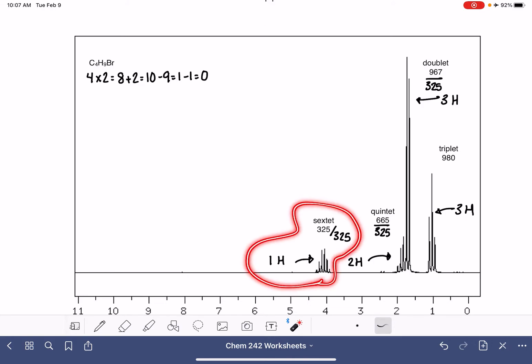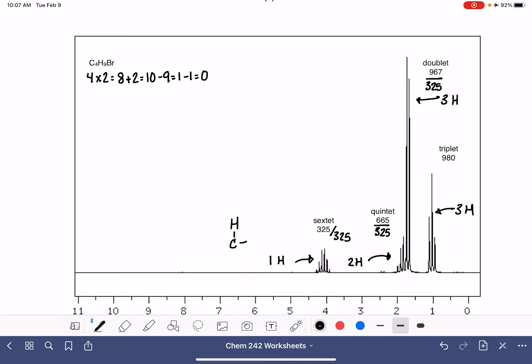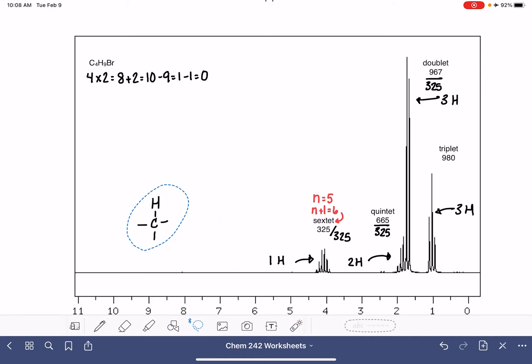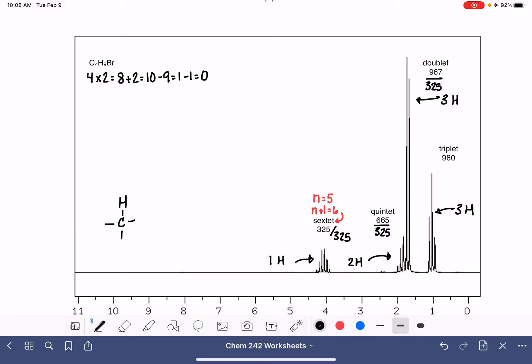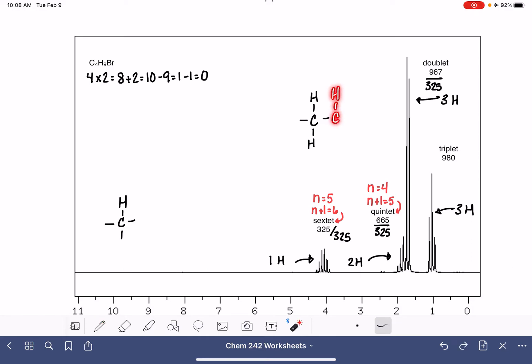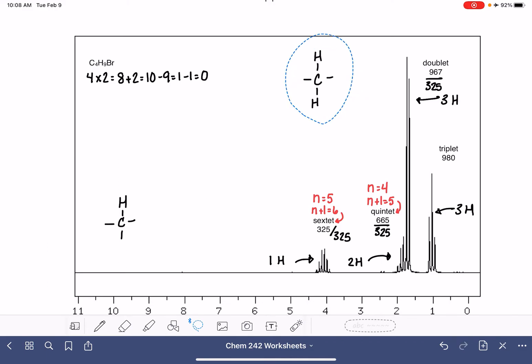Starting with the sextet: we have one hydrogen on this carbon with no other hydrogens, and it's a sextet, so n plus 1 equals 6, meaning n equals 5. That's kind of tricky, so I'm going to set this aside and figure it out later. The quintet has two hydrogen atoms. That's a quintet, so n plus 1 equals 5, meaning n equals 4 — another tricky one. n equals 4 might mean two hydrogens on each side, or three on one side and one on the other. So I'll set that aside too.